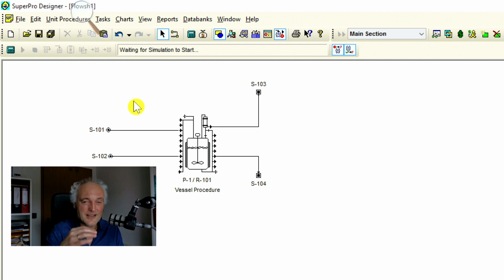Yeah, saving on a virtual setting is different than when I save something here. So I could of course save that. I should do that, but as today we just go with this example, and what I have shown you here is of course in reality drawn in 1 minute. Let's say the falling height is not so advanced in this case. Okay, now I perform the mass balance.